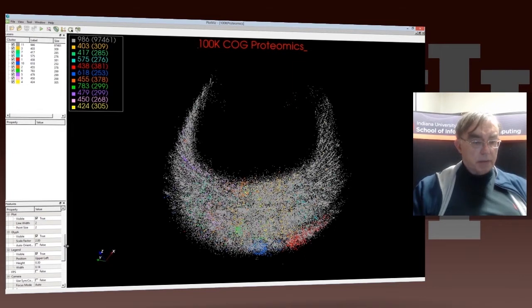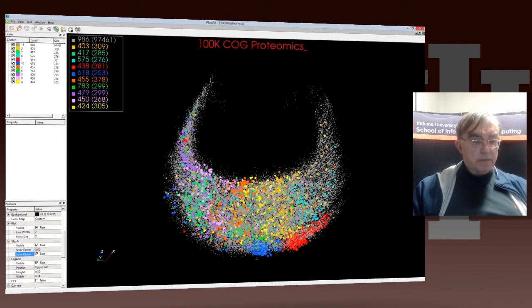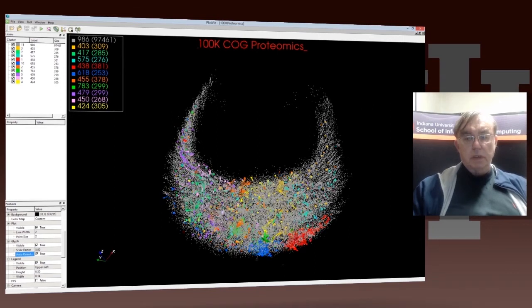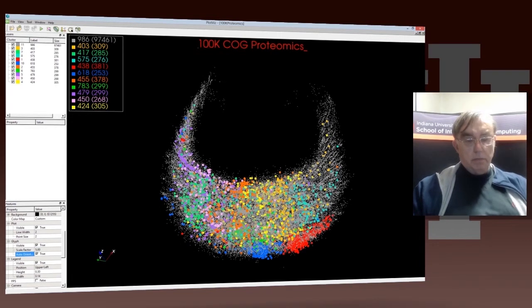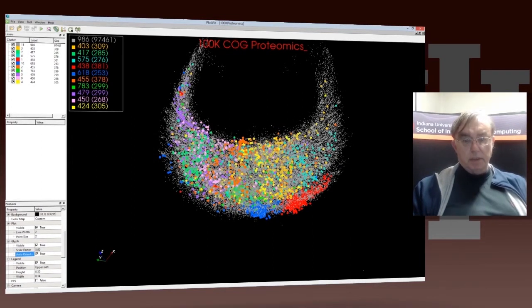Let's try to make those colors a little bigger. And we can do that by looking at the glyphs. Let's come down and find these glyphs. So they're true, auto-orientation is false. We showed you that was a confusing list. Let's just change the scale factor on these glyphs. So now we have our scale factor on the glyphs of five. And you can really start seeing these clusters. And you can see there are some close structures and some broad structures. Let's move it up a little, because we don't really want these tails. So let's make the whole thing just a little bigger.